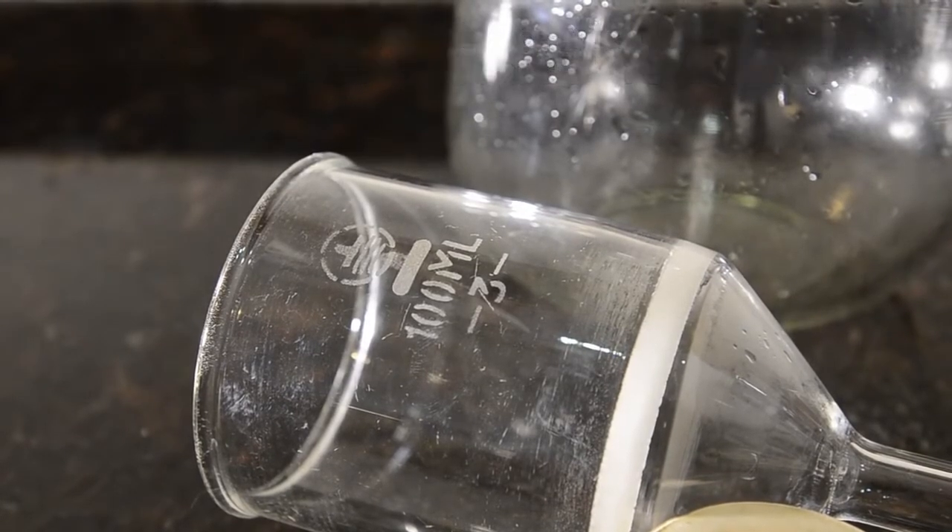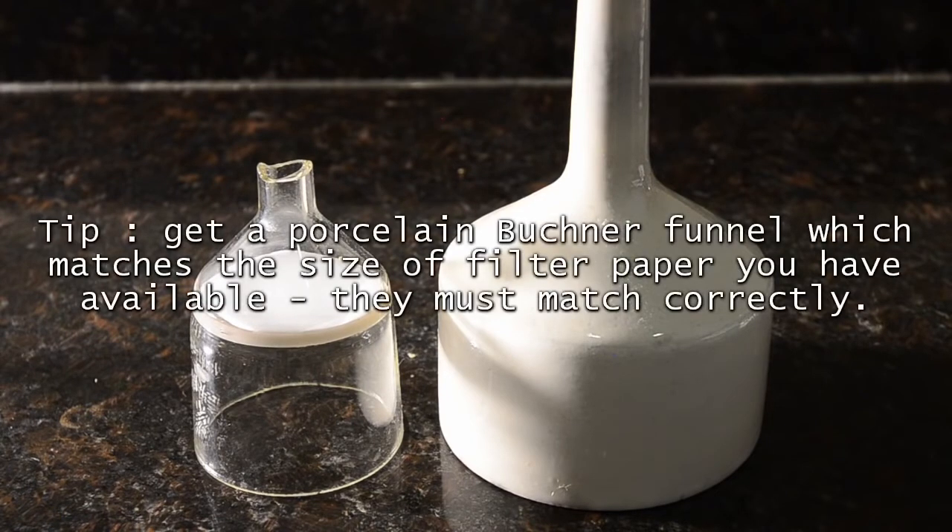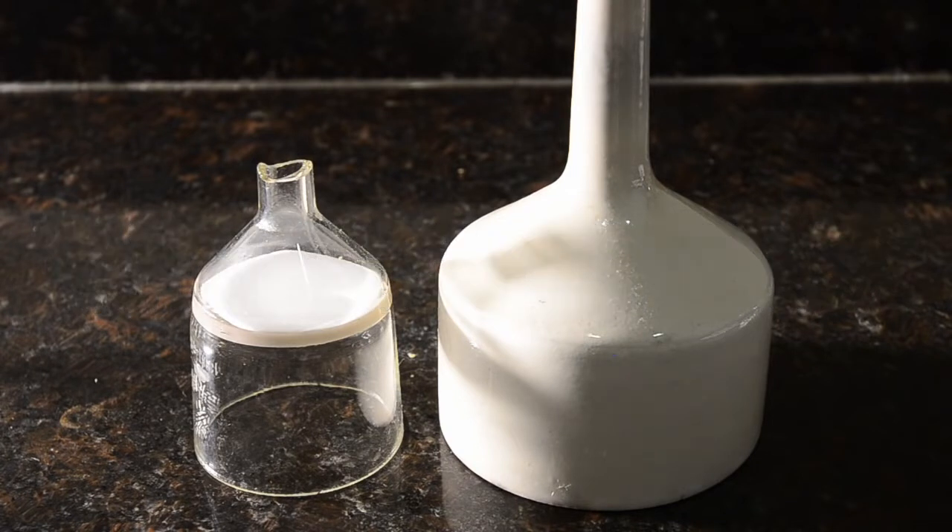To filter using a vacuum and regular filter paper, you'll need a porcelain Büchner funnel like the one on the right. Be warned that your filter paper size will need to fit it exactly. The sintered glass filter on the left we picked up second-hand for next to nothing — it has a broken glass tube but still works great, and we decided to give it a loving home.